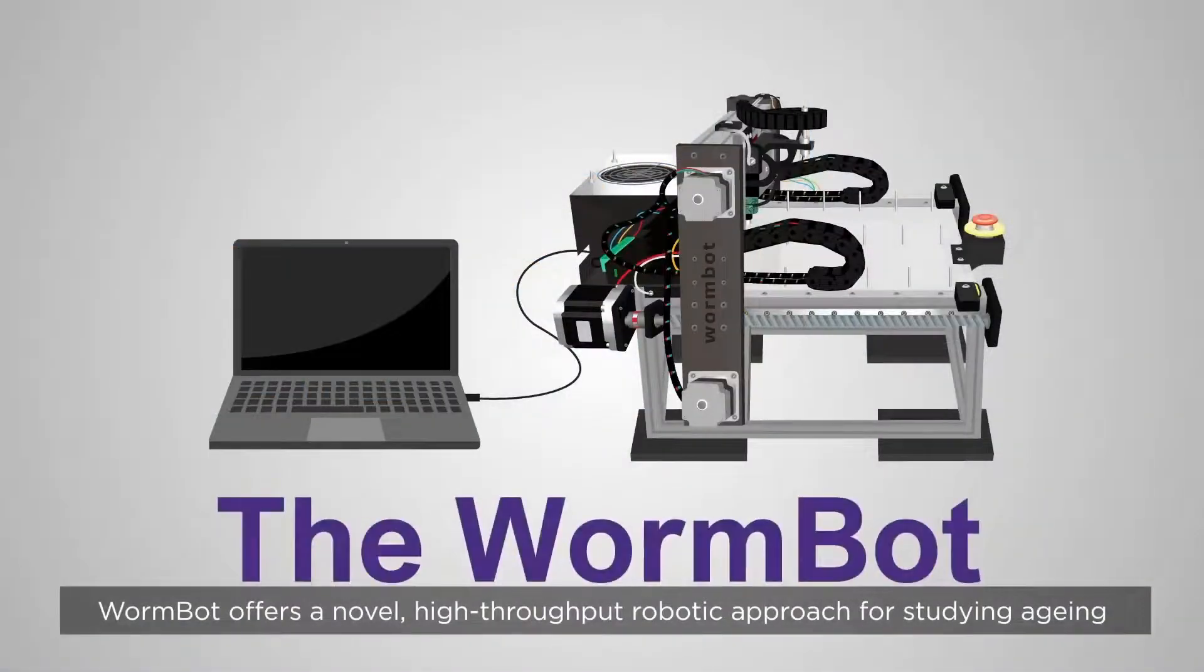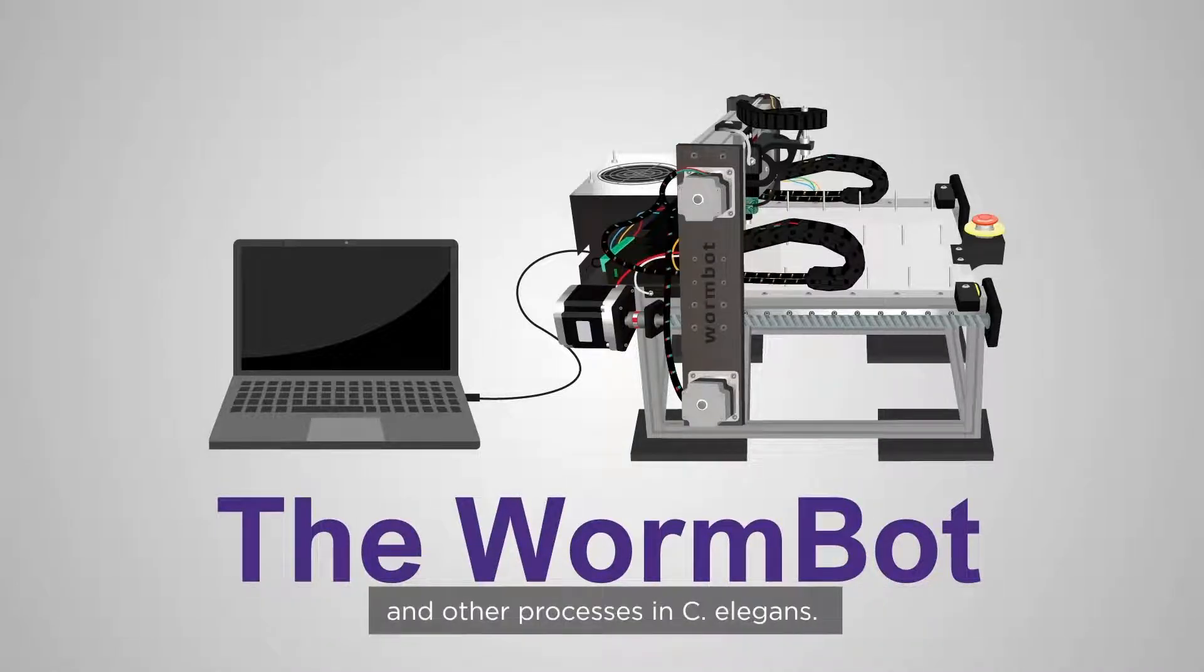WormBot offers a novel, high-throughput robotic approach for studying ageing and other processes in C. elegans.